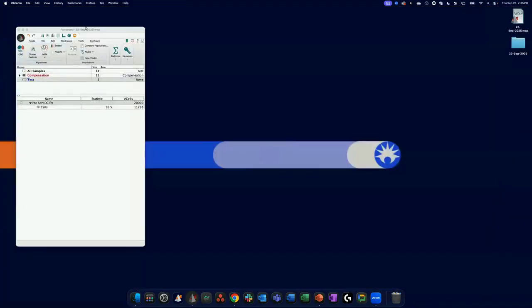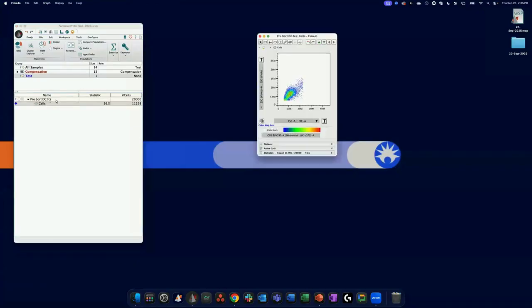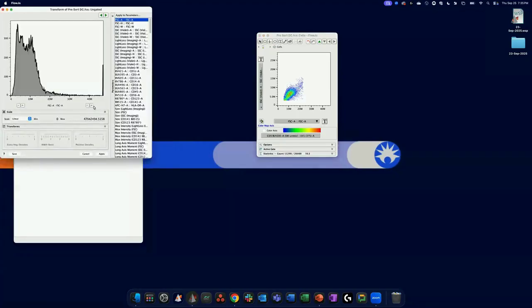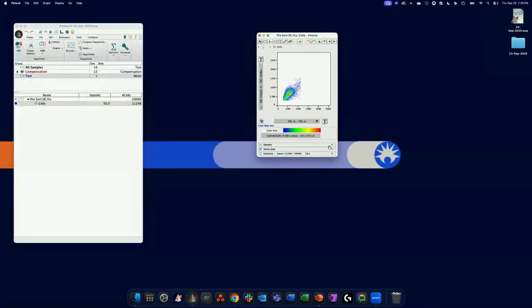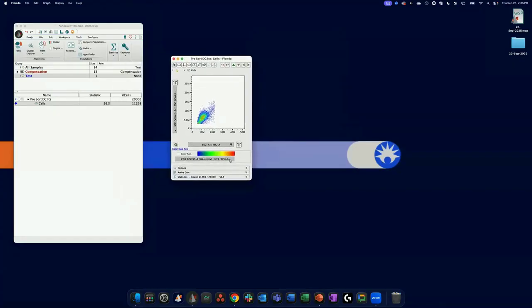Now, of course, if you're an avid FlowJo user, you're very used to having a graph window, hitting this T button, going to customize axis, and doing kind of these one-off changes. That's not to say you still can't and that it won't ever be necessary, but you'll find yourself doing it a lot the more and more you work with this data. So it's helpful to have some default rules.